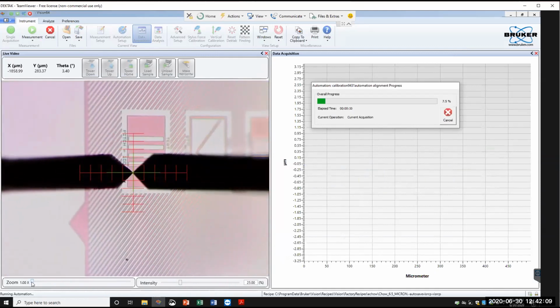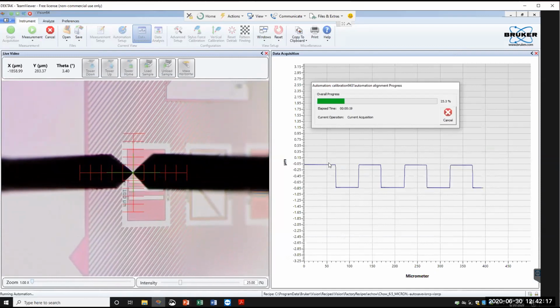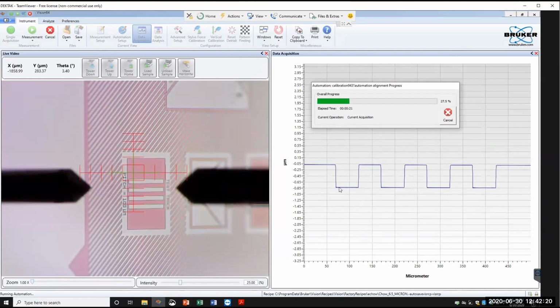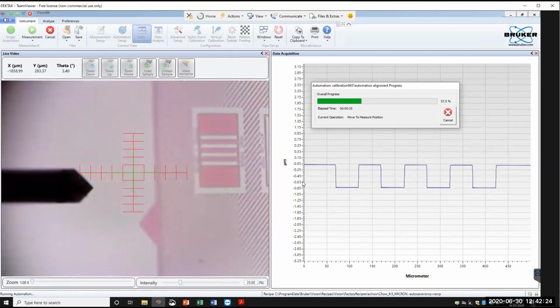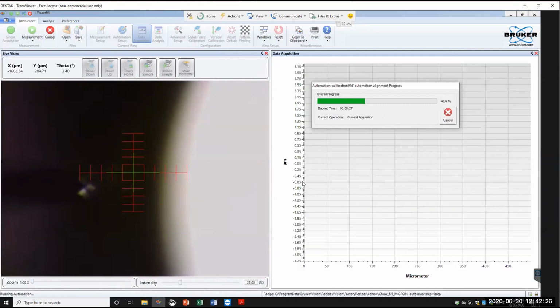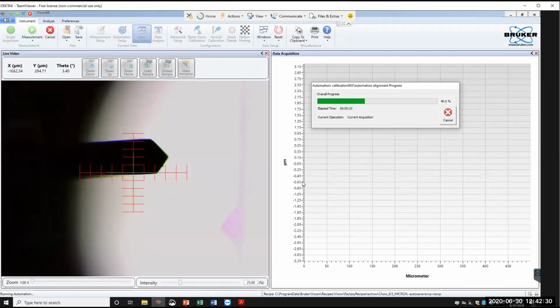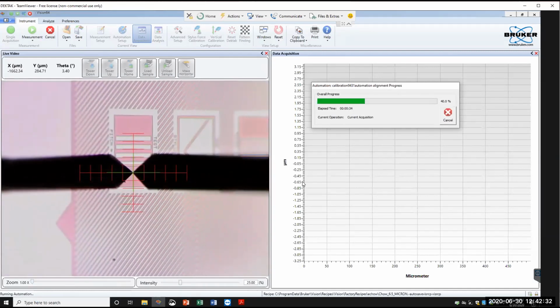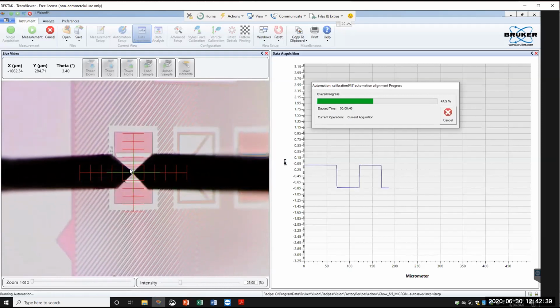It's going to do 3 scans. So it will do first scan. And I have to point out that there's a bug in the software that during the display, this number is actually not quite right. But after they finish the scan, it actually displays the correct number. So now it moved to the second point, basically in the middle. It moved about 200 micron and does another scan.